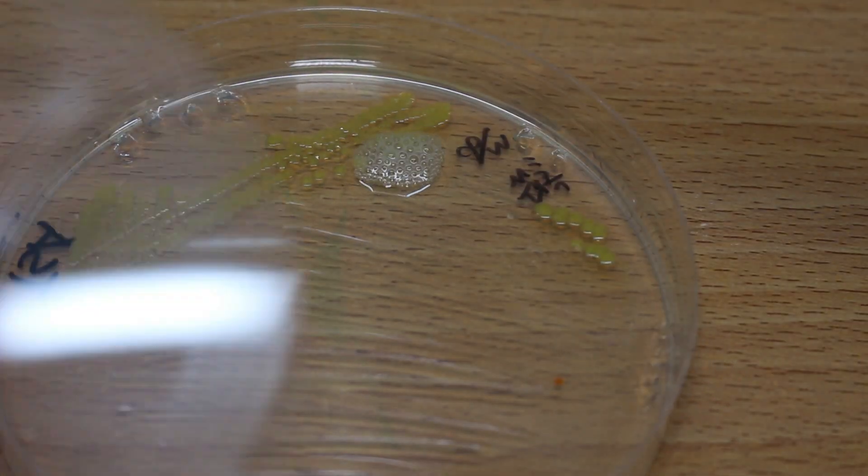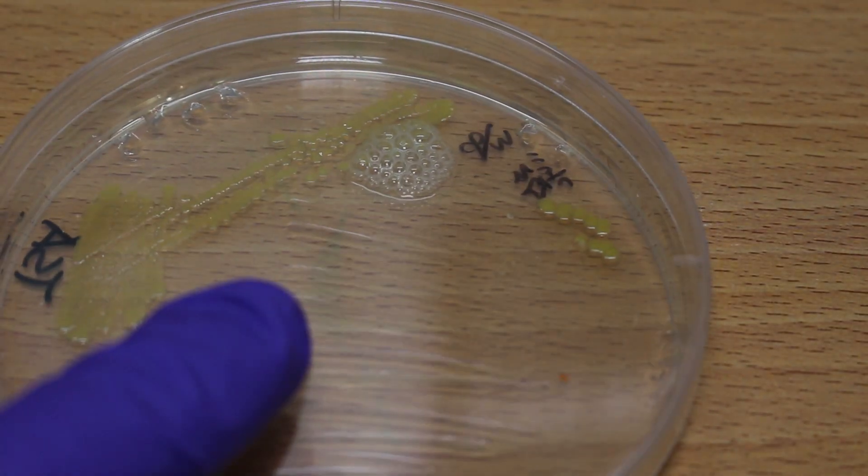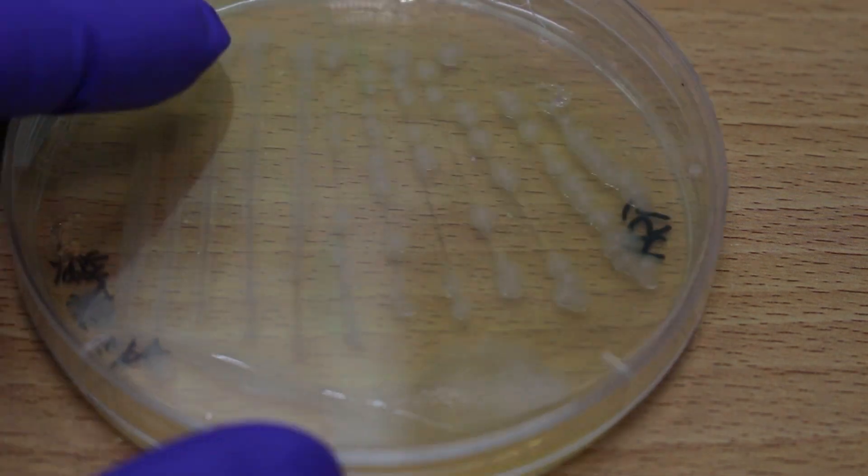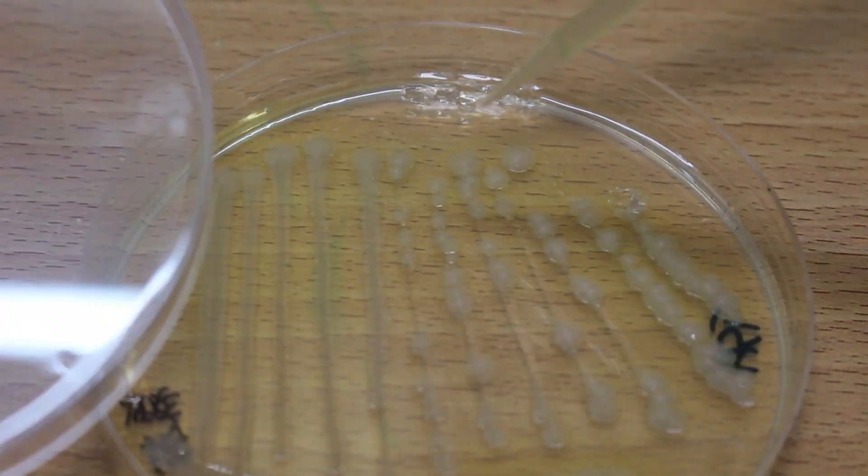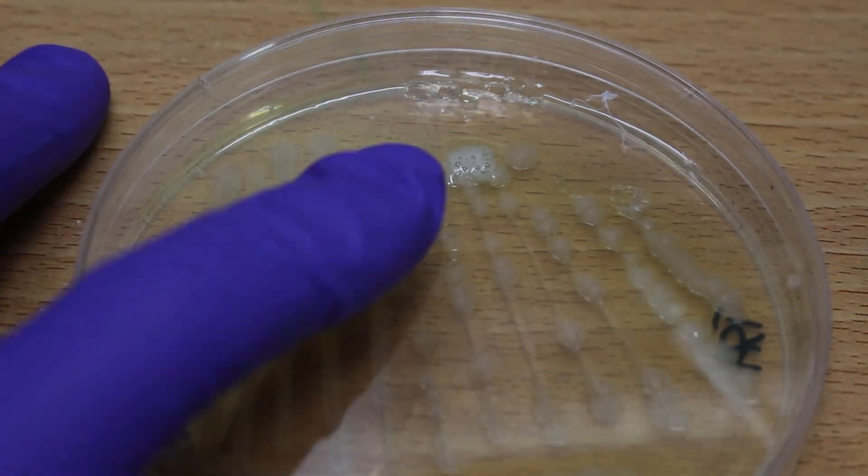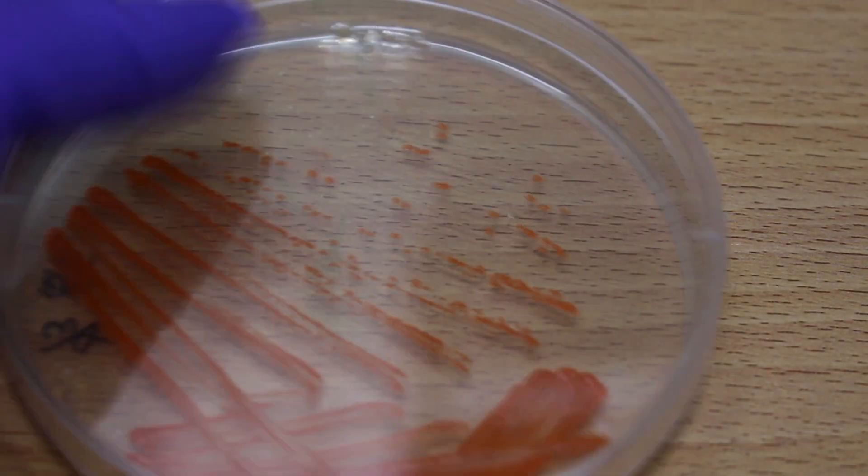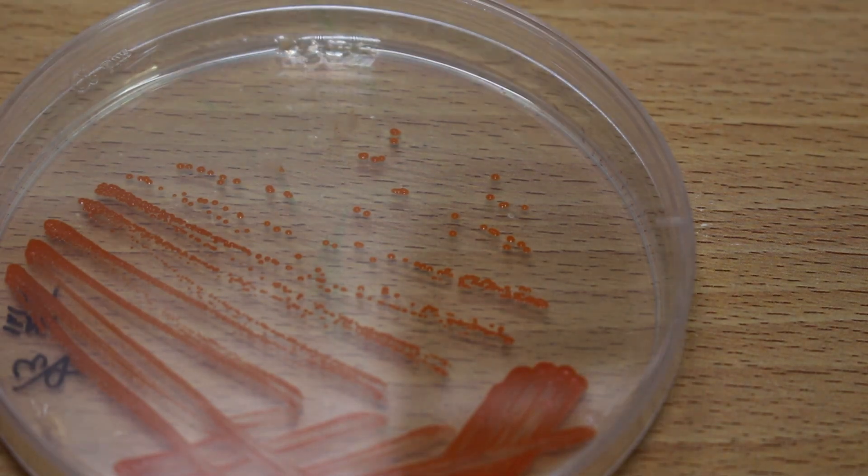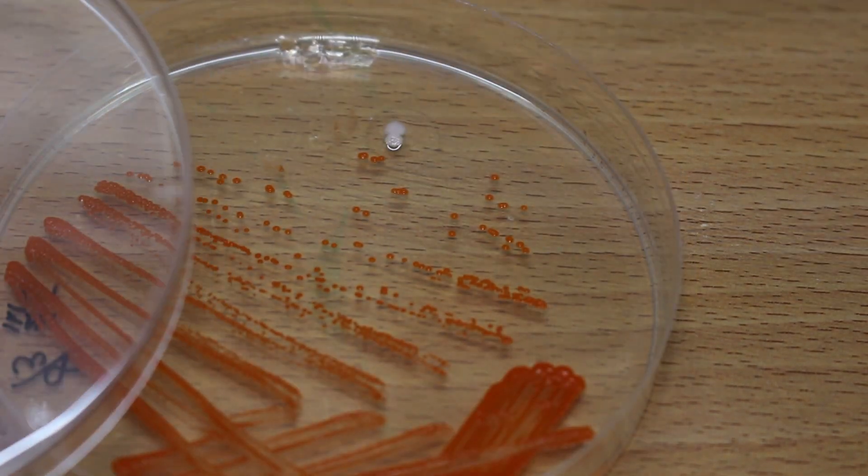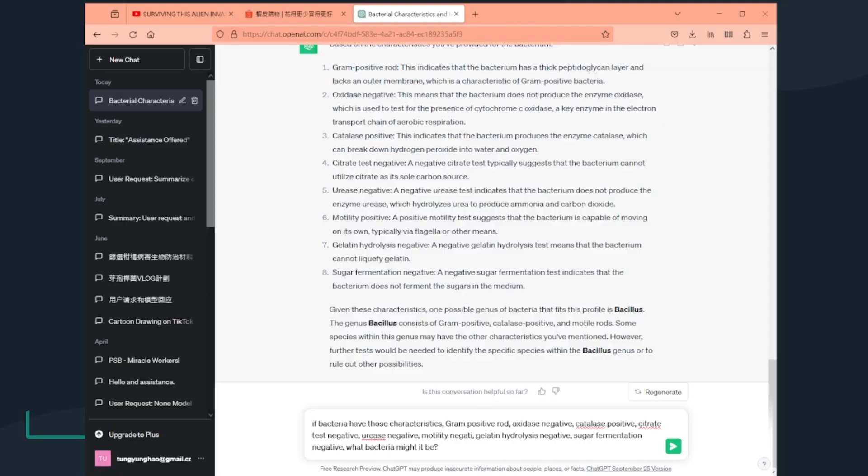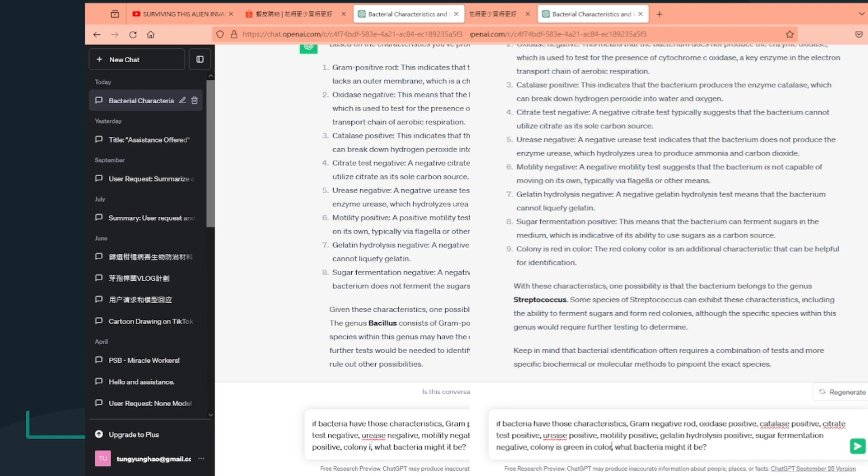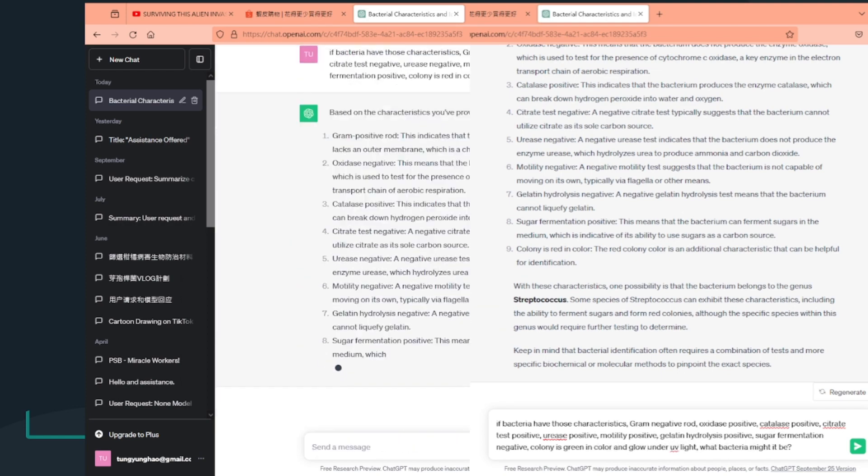And how am I going to do that? Well, I can try to ID them by myself, or I can post the results on the internet asking other people to help and get roasted like all those posts you see on Reddit. A third option would be asking our good friend ChatGPT for an answer. So I decide to do both and compare the results from me and ChatGPT to see which of us can make the right answer.